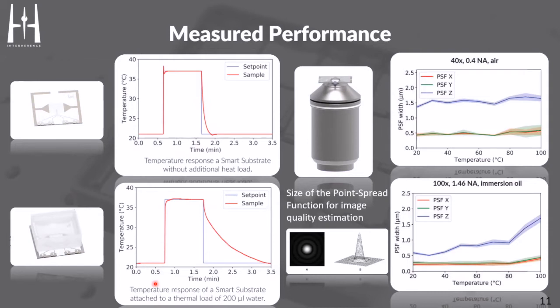So you can change your temperature between room temperature and 37 degrees within a liquid environment in less than a second. And this allows for some interesting experiments.